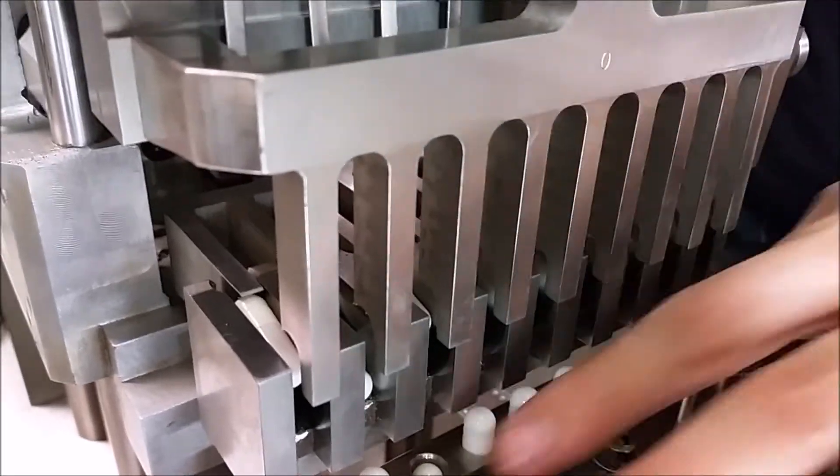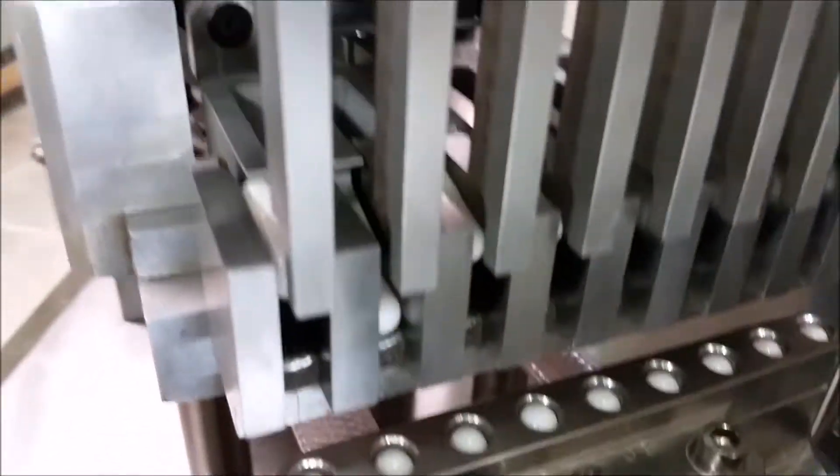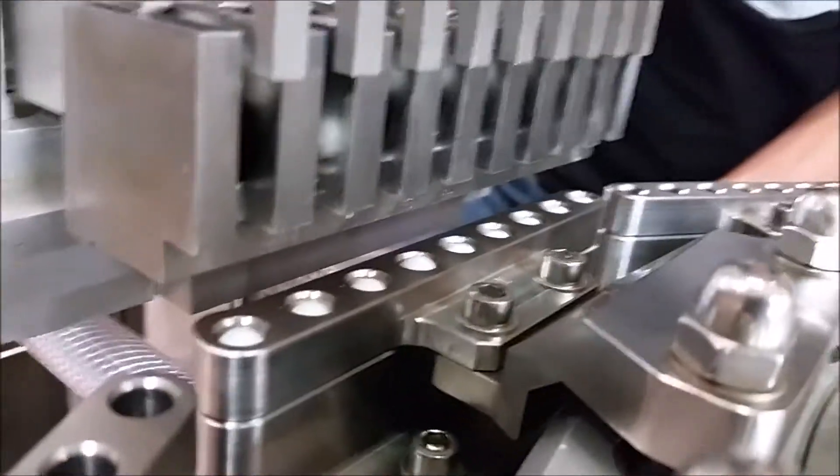These won't go in very much now because there's no vacuum on, but you can see where they're falling essentially before you do that. Now let's take a look at how to actually adjust those, what they affect, and what to look for.